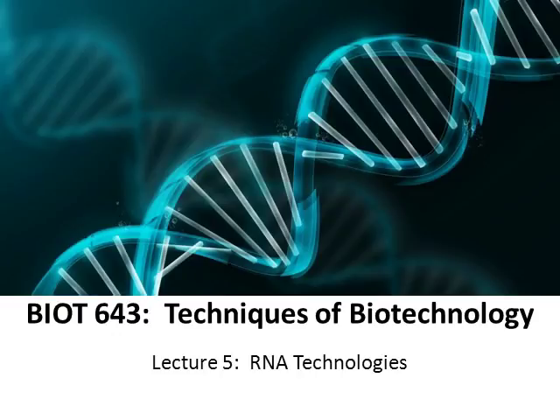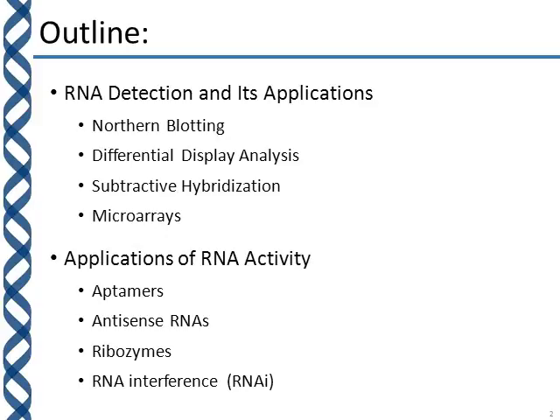Welcome to Week 5 of BIOT 643. This week we'll be discussing RNA technologies. In this week's lectures we'll be discussing RNA detection and its applications. Within this we'll be discussing northern blotting, differential display analysis, subtractive hybridization, and microarrays.